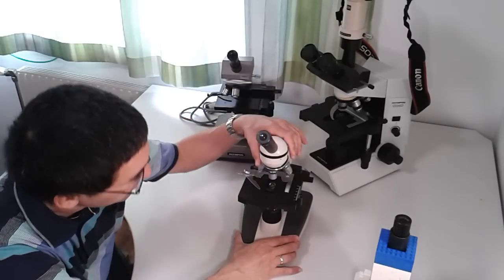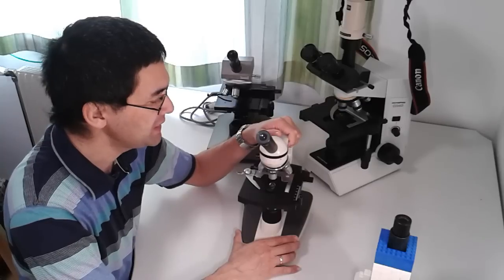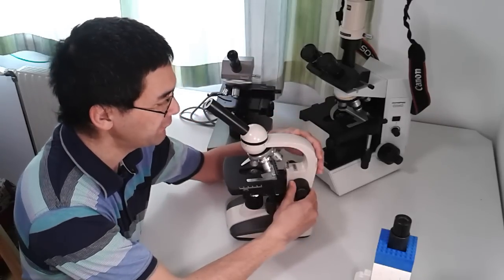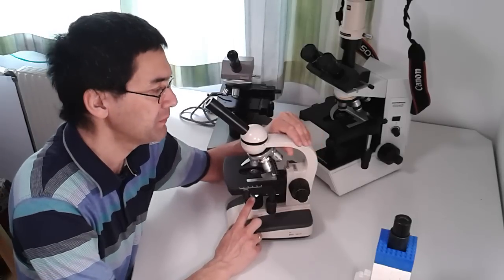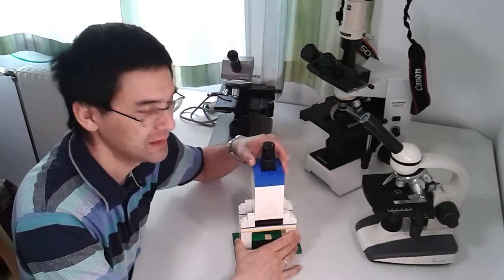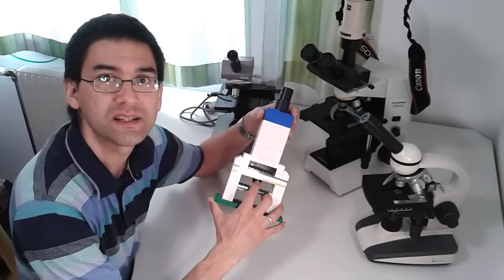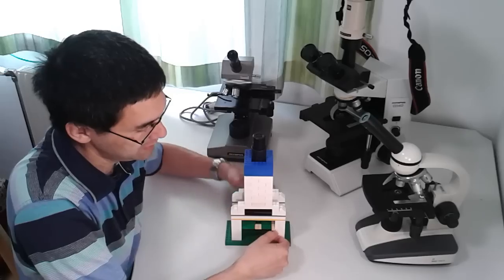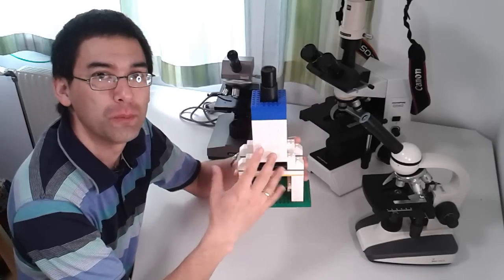This here is a roughly €200–220 educational microscope. It has four objectives including an oil immersion objective, which I don't particularly recommend. It has everything you need for amateur microscopy: a mechanical stage, coarse and fine focus knob, and an LED so it can even be battery operated, giving some portability. Then last but not least — more as a proof of concept — this is a LEGO microscope with only one objective, giving 100x total magnification with a 10x eyepiece and a 10x objective. You place the slide on here, put a small LED lamp underneath, and focus by moving the tube up and down.